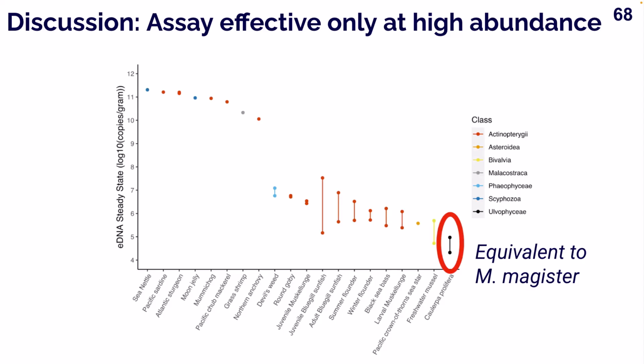So I have a colleague who worked with Caribbean spiny lobster and could very clearly see the lobster. However, when they used their assay to apply to their eDNA water samples, they could not detect the lobster. Also, we did apply it to some Wacoa cruise seawater eDNA samples as well, and very clearly the Dungeness crab occur there. We have some caught from there. We weren't even getting detections there. So this suggests that they just shed less DNA, and just a general challenge for the decapods.